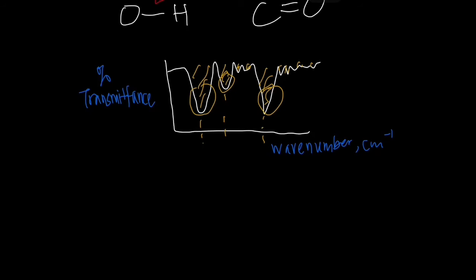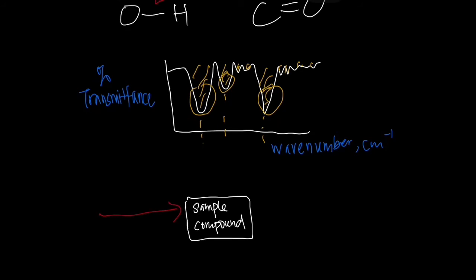In the IR spectrophotometer, we have the sample compartment, the sample, which is the organic compound. And we have the IR radiation supply. The mostly used range of IR radiation for the study of organic compounds is 4000 to around 400 cm-1.